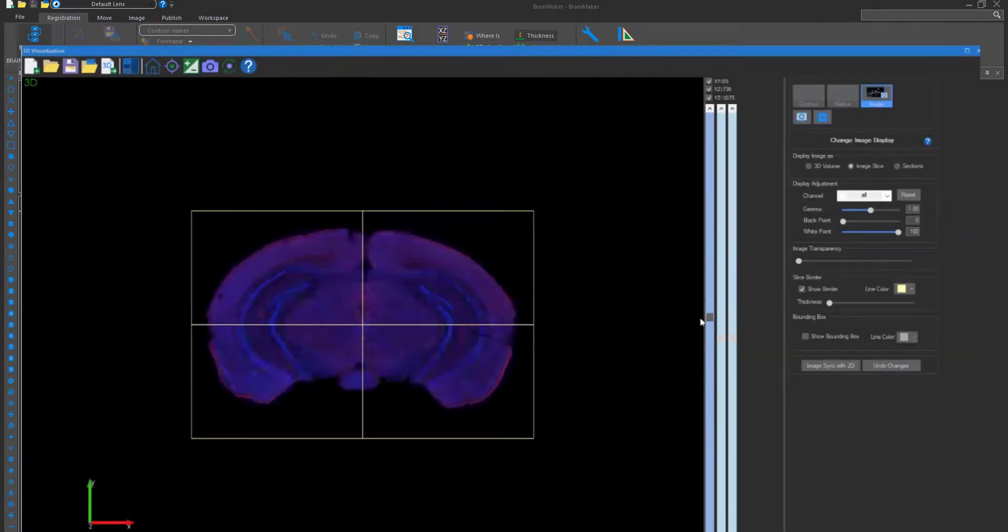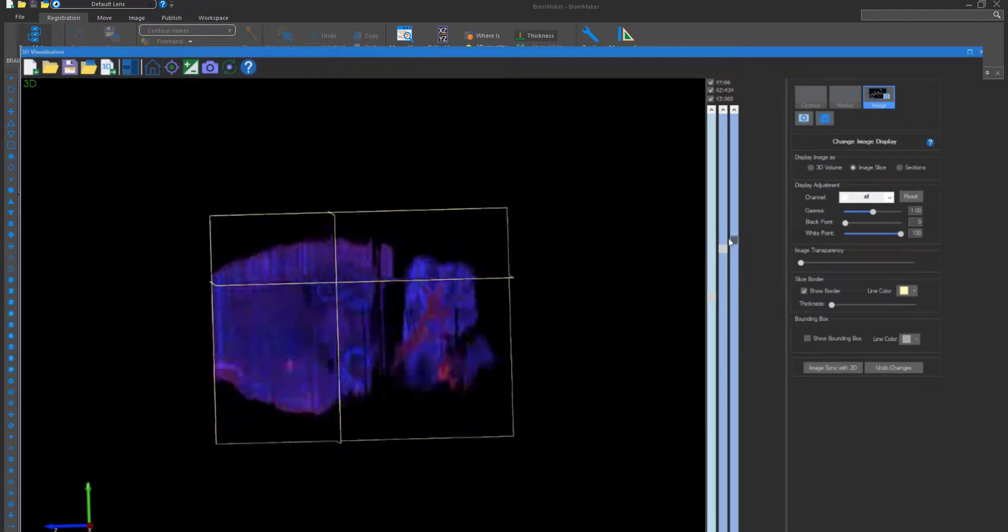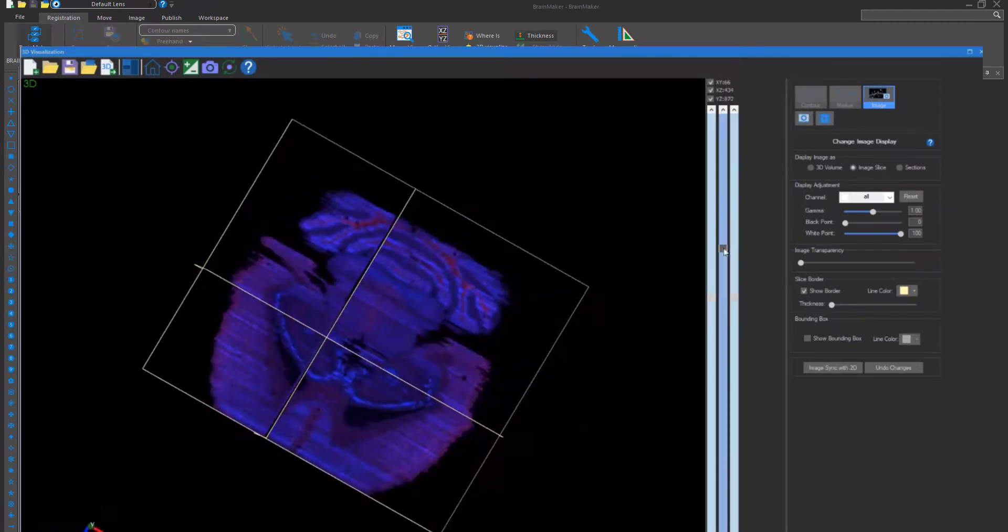After registration, BrainMaker provides you with a volume that can be viewed in any 3D orientation.